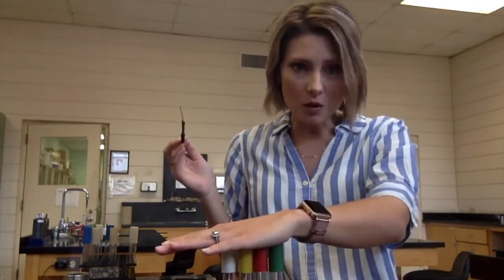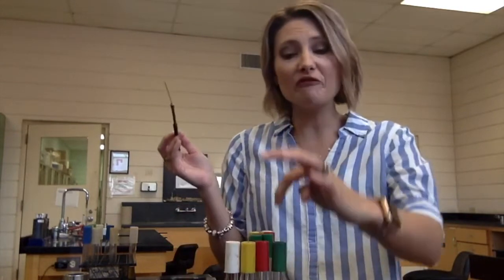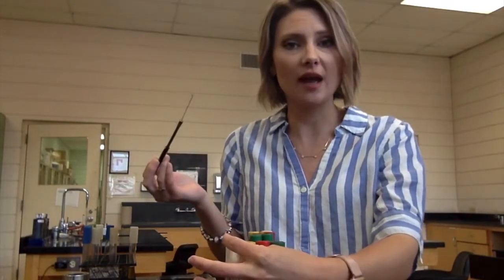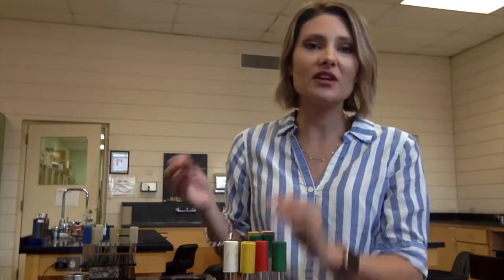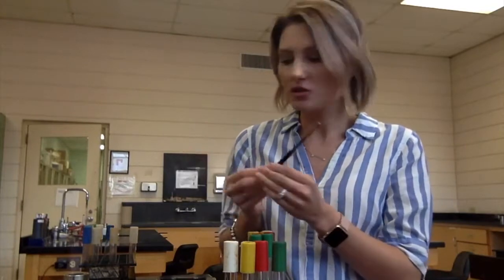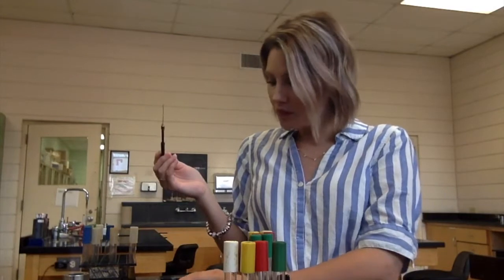Now, for this, however, our pH indicator is already in the tubes, and we have 4 different substrates that we're looking at. So we don't want to mix the sugars because you could get a false positive if you accidentally mix the sugars, okay? So I've got my loop flamed. It's cool. I'm going to go in.